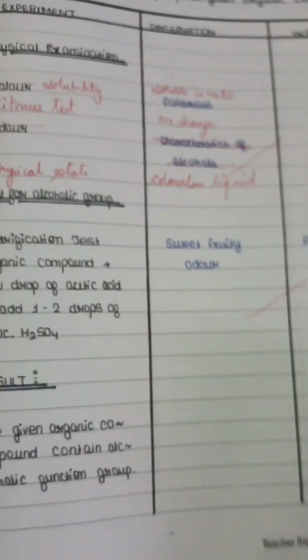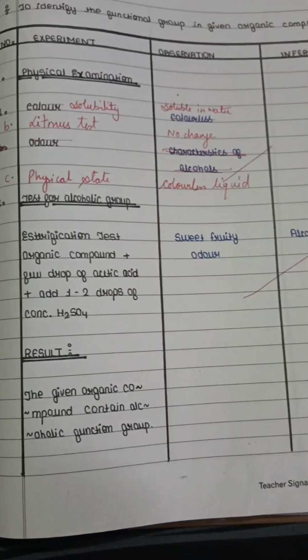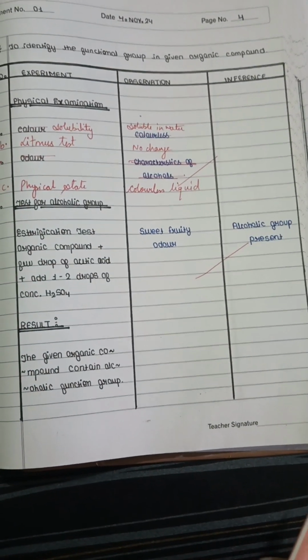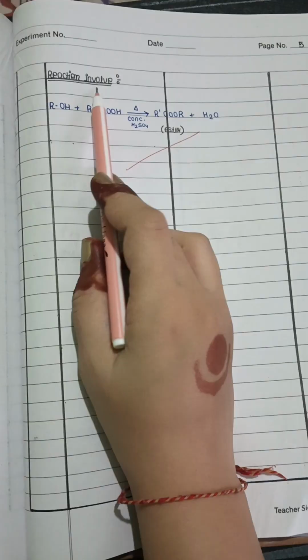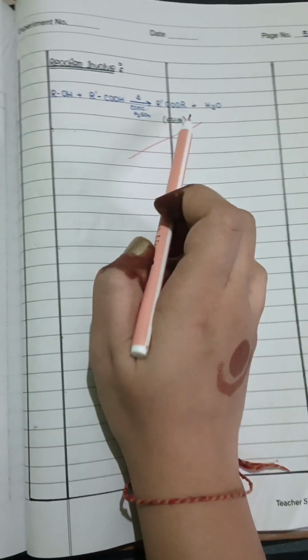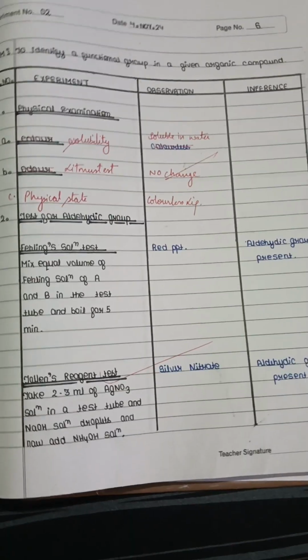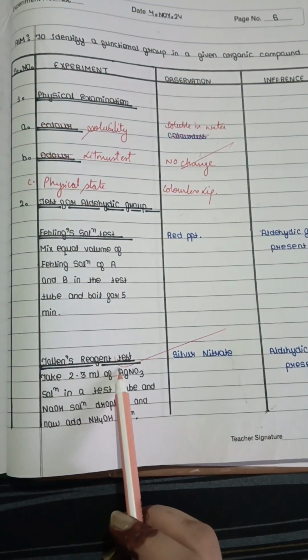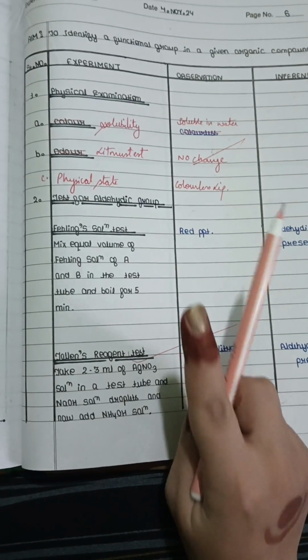Okay, so now here are the tests which have been written for you. This is the test for alcohol. You also have to write the reaction involved. In exam also, the examiner asks you for the reaction involved. The next is Fehling test and Tollens test. In exam, just write one test.